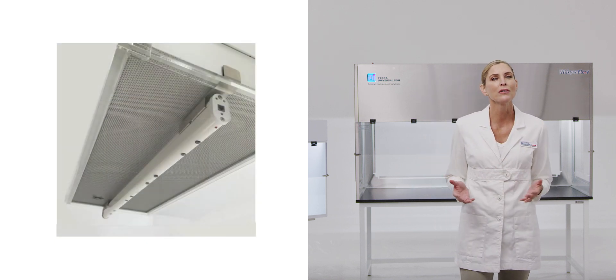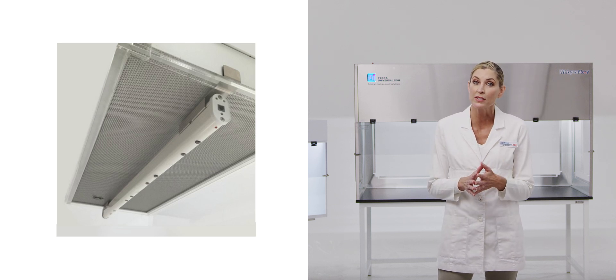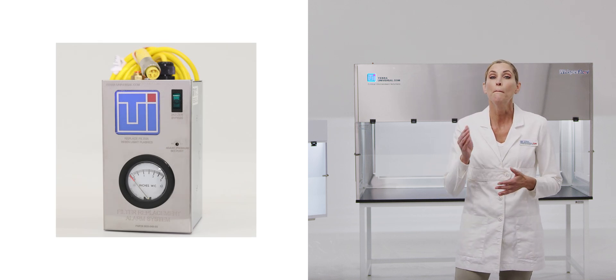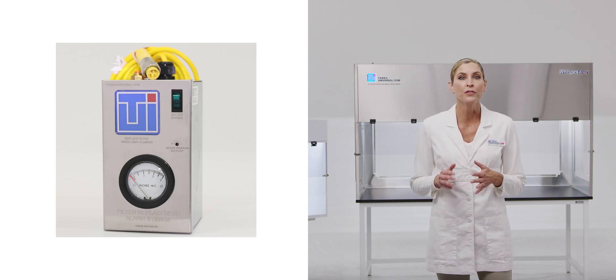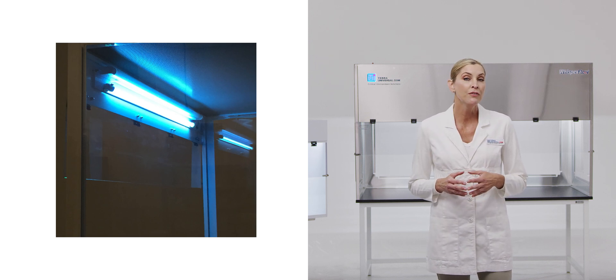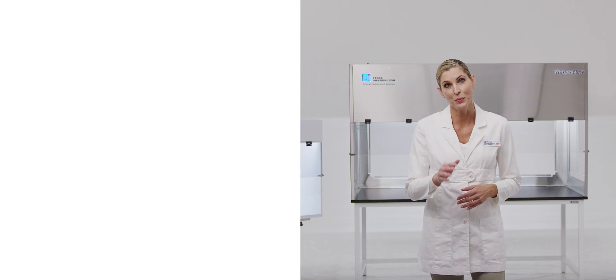Ionizing bars neutralize static charges that attract and hold particles to work surfaces and hood frames. Tara's audible and visual filter replacement alarms monitor HEPA filter saturation levels and provide alerts when filter replacement is required. UV germicidal lamps emit ultraviolet light at 254 nm to inhibit microbial growth within the work area.